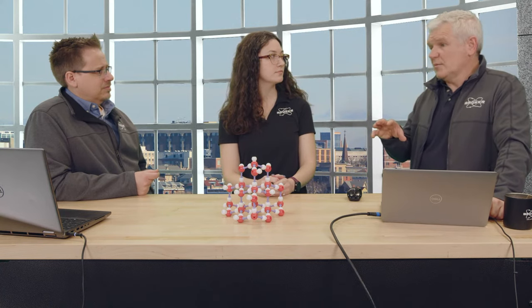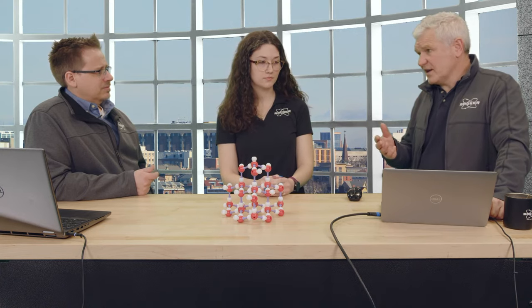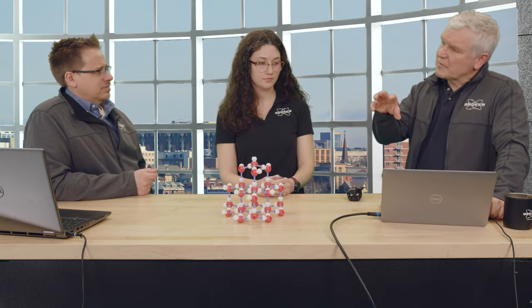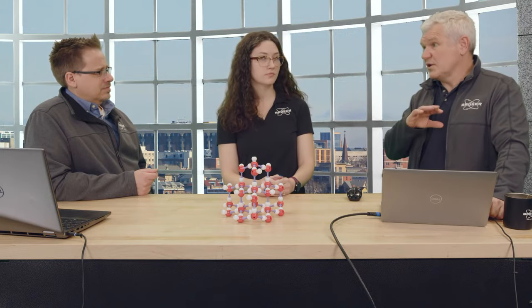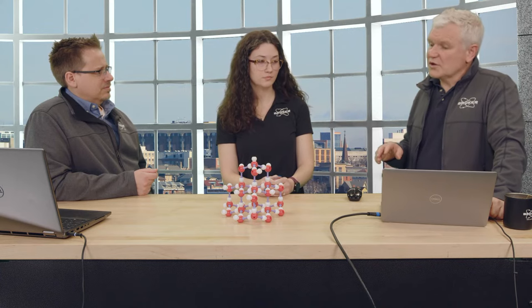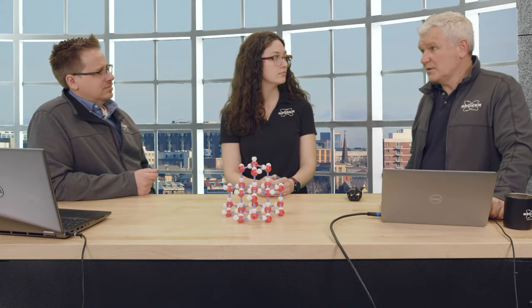But initially, that's good enough for structure solution. You can specify, in my case, I used ShelXT, what we call intrinsic phasing. You can point Jana to use that software for structure solution, and it solved it right away. You can also solve your average structure in Apex, and then there are import facilities in Jana. Superflip, which comes with Jana, is very powerful. So there are also different methods of solving the structure. Sometimes it's a little more tricky. In this case, it was very straightforward.